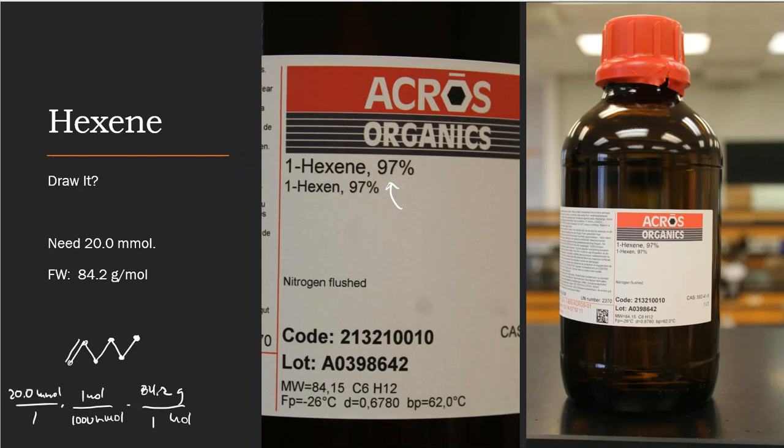Okay, so those are my ingredients. Now let's take a look at the glassware setup. What do I need?